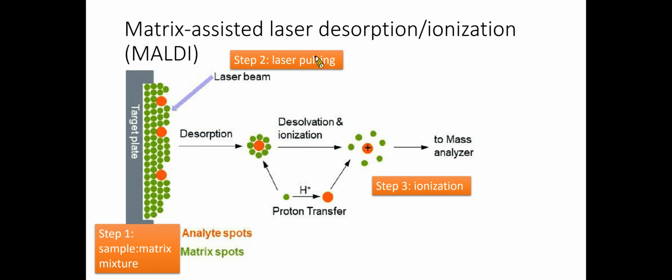MALDI mass spectrometry is characterized by high sensitivity, wide application range, and simple operation. It has extended the traditional mass spectrometry technology, mainly used for small molecule research, to analyze a range of highly polar, hardly volatile, and thermally unstable samples.